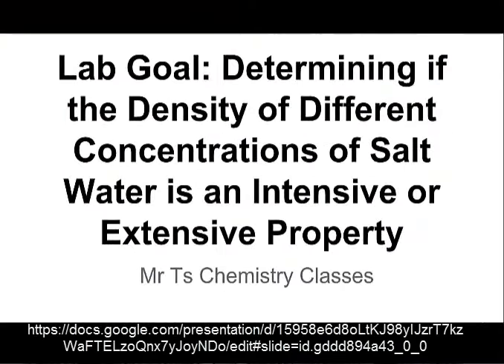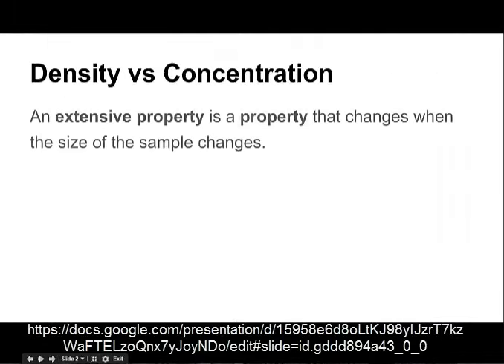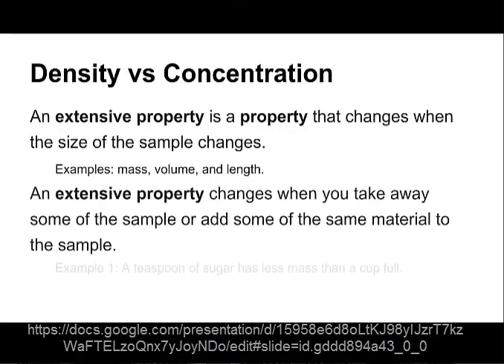This video instruction is designed to help you get set up for the saltwater density lab. Before you watch this video, I suggest you watch the presentation that I've created that gives you the main goal and some tips on setting up your procedures for this lab. This will be the lab in which you have your first experience with a program called Logger Pro. I'm going to show you how we're going to use that for a lot of labs in here.